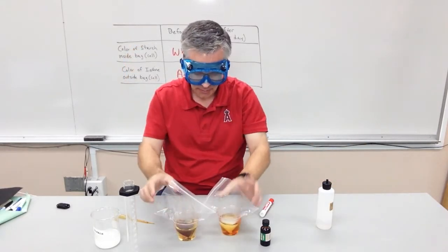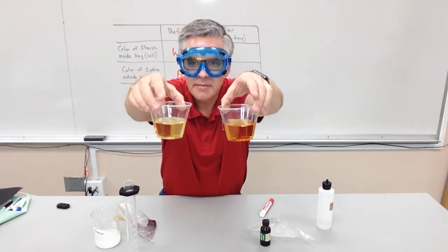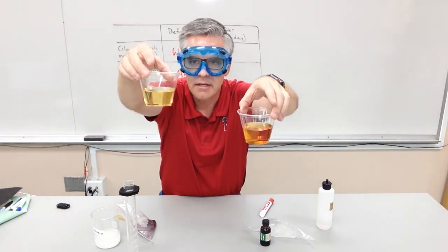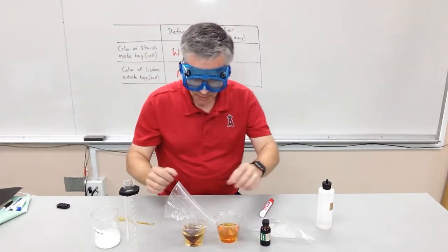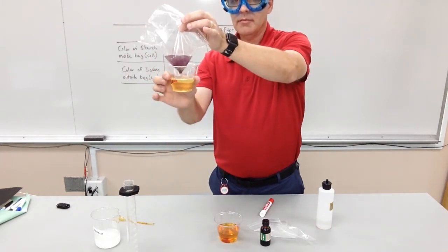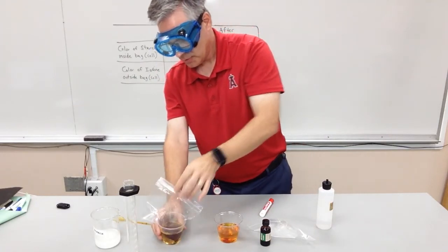Let me get rid of the bag so you can check that out. They started off about the same color. This one is the one we just started with, and this is the one that was sitting overnight. You can see that it's a lot lighter in color. I'm going to let you put the after in. This is still considered amber, but I might call it light amber. It's definitely not the same color it was before, and the baggie is more of a purplish color.